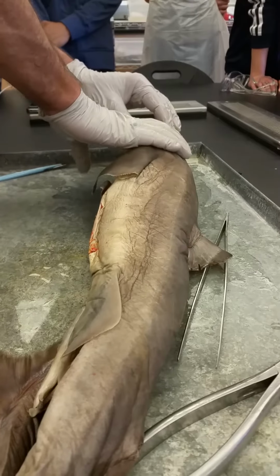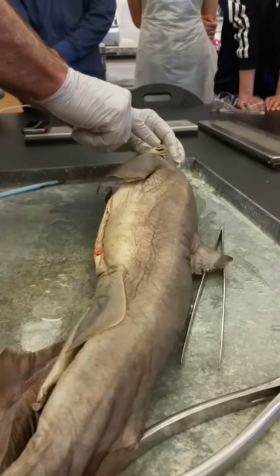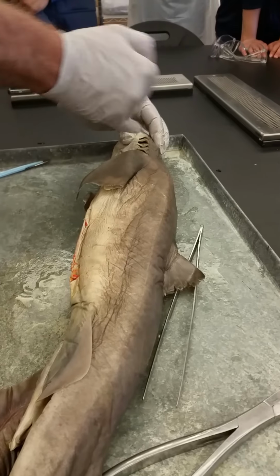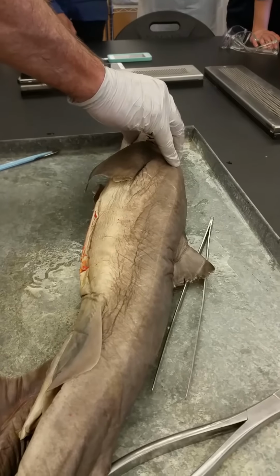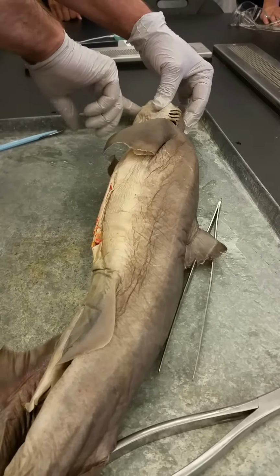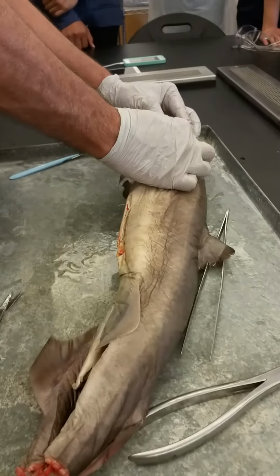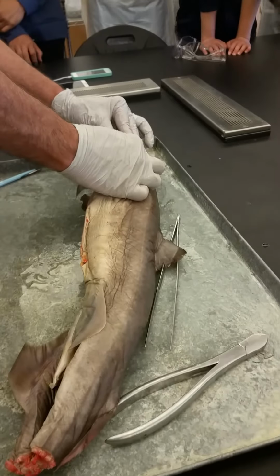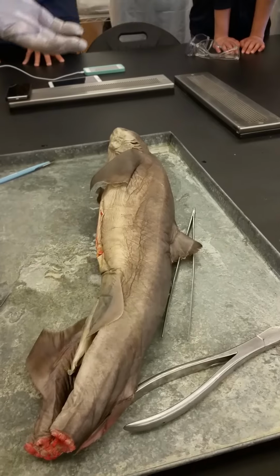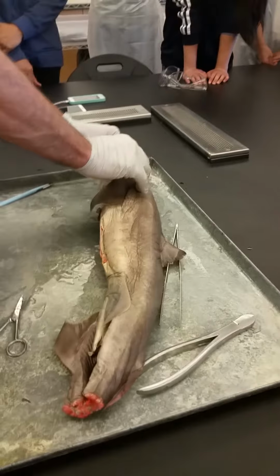Now, unlike the bony fish that have an operculum over their gills, sharks have separate gill openings for each gill. In most sharks, there's 5. We call them gill slits. So instead of one operculum over their gills, there are individual gill slits, usually 5, although in some cases there's 6 or 7. And so, again, water goes in the mouth, over the gills, and out these gill slits. When the shark is breathing, you see those gill slits flaring as they pump water over their gills. Again, some of the open ocean sharks use ramjet ventilation and just swim continually. Some of the bottom sharks pump water over their gills by buccal pumping, just like we talked about.